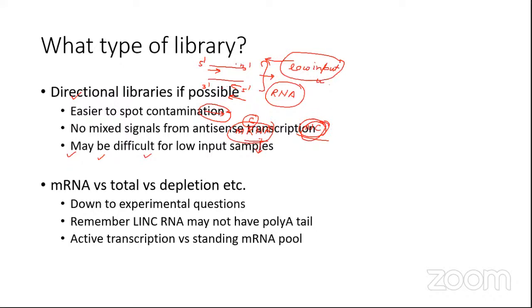If our interest is in other types of RNA. But if we want to study along with messenger RNA, then we have to go for total RNA sequencing. But if our interest is not at all in the study of non-coding RNA like transfer RNA or ribosomal RNA or long RNAs, microRNA, then better to go for mRNA enrichment or rRNA depletion.